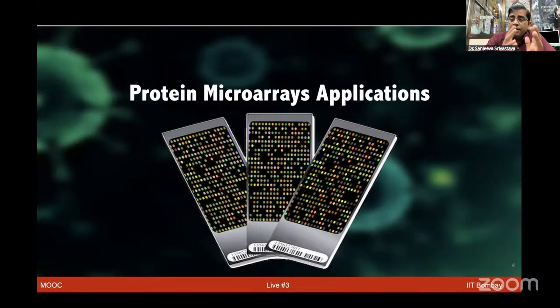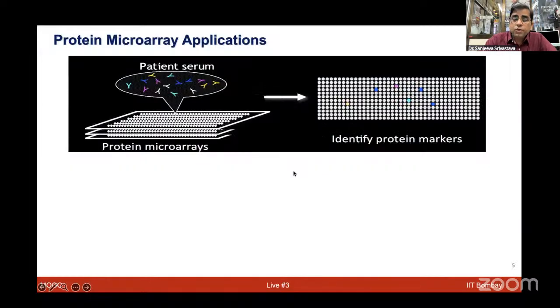So therefore, I'm just trying to give you the contrast, looking at the different technologies and where some technologies can be more beneficial. So for example, microarrays are currently not as heavily used as mass spectrometers, but they have a very unique and niche area which mass spectrometry cannot replace. If the goal is to look at a lot of functional proteins, the functionalities of unknown proteins, where they function, what kind of interacting partners they have, for all of this, protein microarrays are a very beautiful, elegant platform.